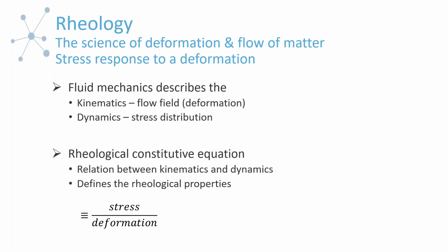As an example of this, which I think many of you may have heard of, we had, I guess, a year ago now, a webinar where we were focusing solely on differentiating what is steady shear viscosity versus extensional viscosity. The big difference is really the type of deformation that you're imposing to the system. So you're going to have a different stress response for the different types of deformation. And that's how the different rheological properties are defined.